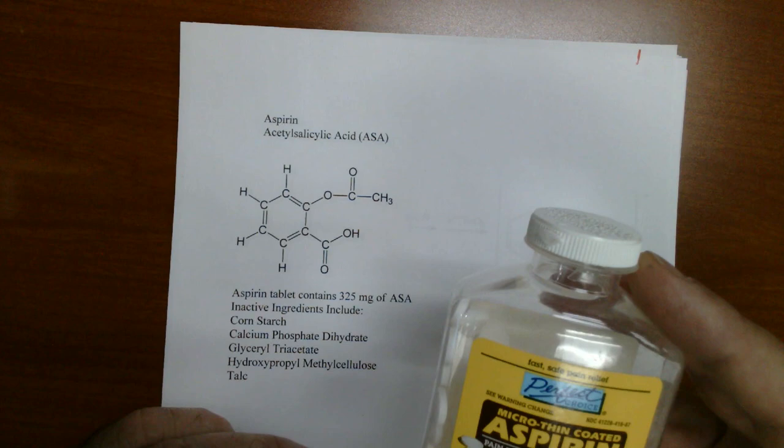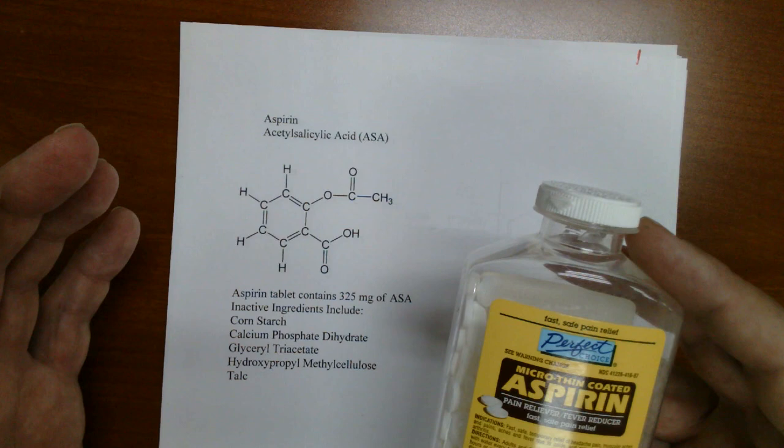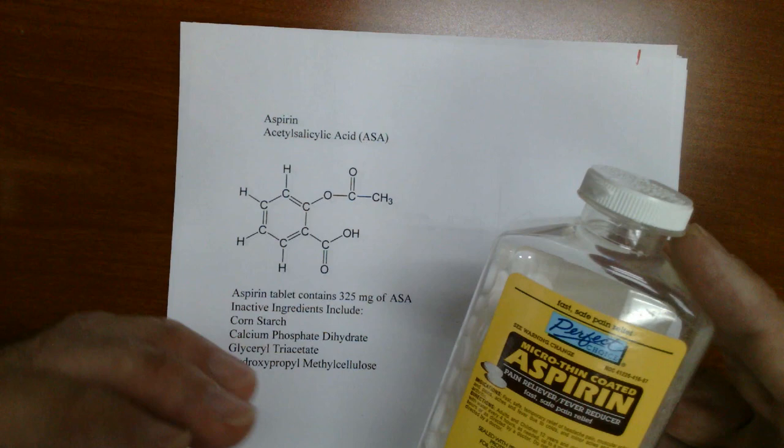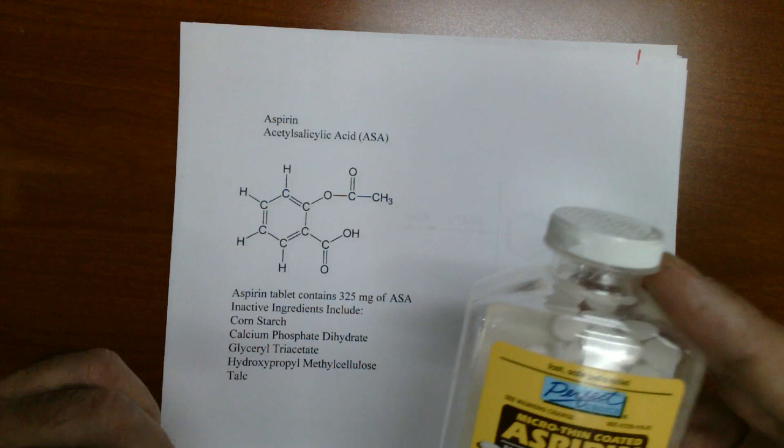Okay. Now, personally, I'm kind of a lazy guy, sometimes. And so if I were faced with this challenge, I would probably just take one of these tablets that has 325 milligrams and weigh that tablet on the analytical balance. And then I take my mass of the active ingredient over the mass of the tablet, multiply by 100%, I'd be done. I'd be out riding my bike, playing frisbee golf or whatever.